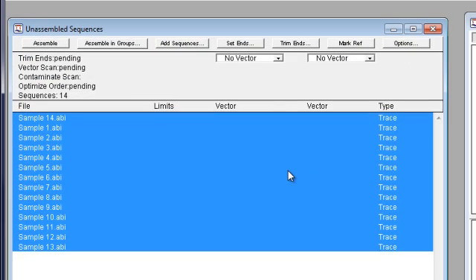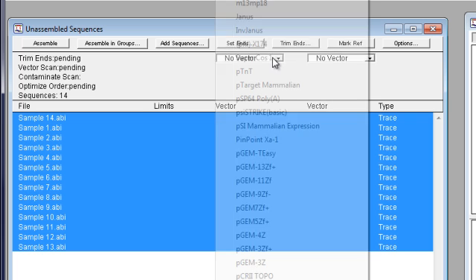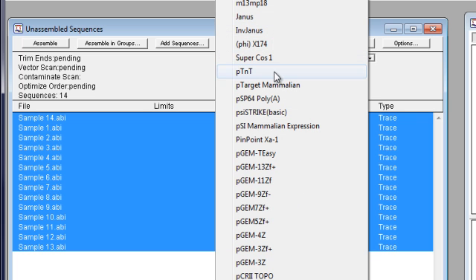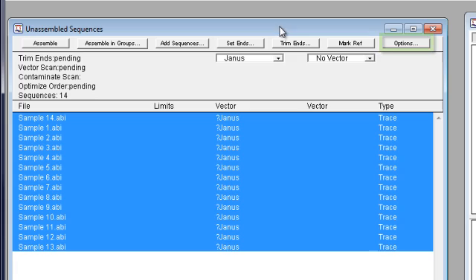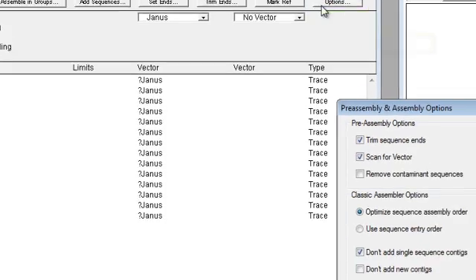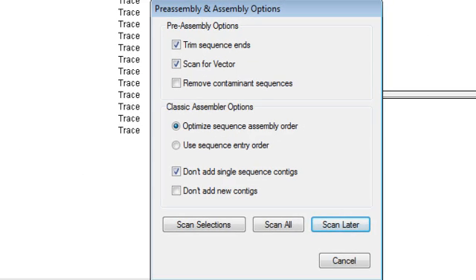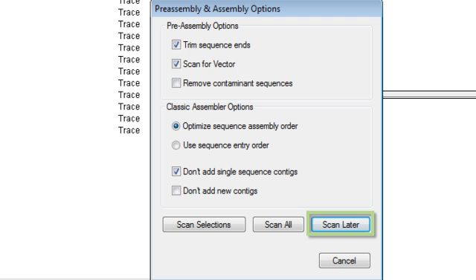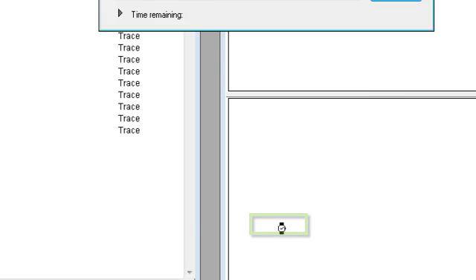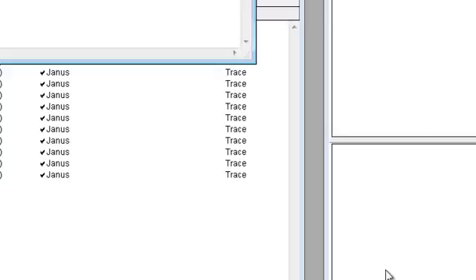Once these files are loaded and selected, I'm going to select Janus from the Vector drop-down menu. If I click the Options button, I can see that SeqMan is going to trim sequence ends and scan for vector. If I click Scan later, the quality and vector trimming will happen during the assembly process. I'm going to click Scan All so we can see the trimming results.